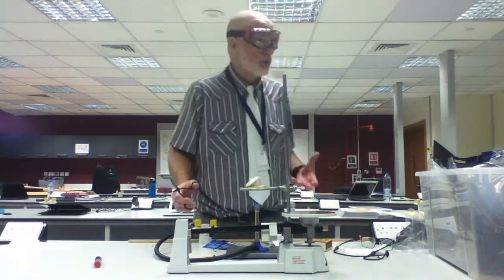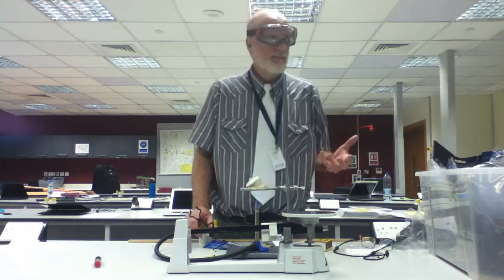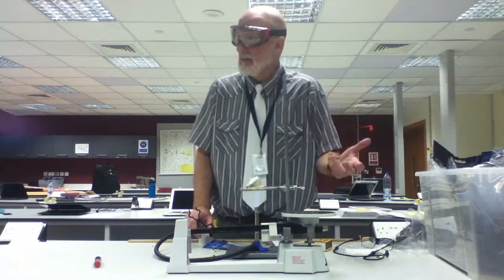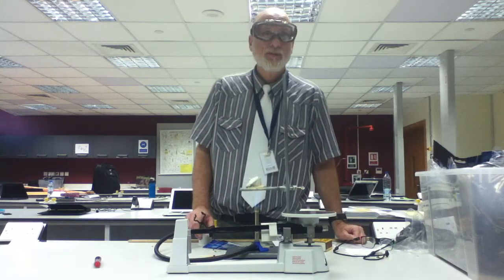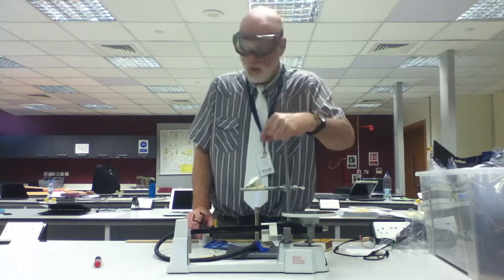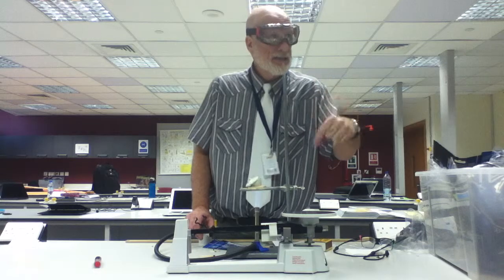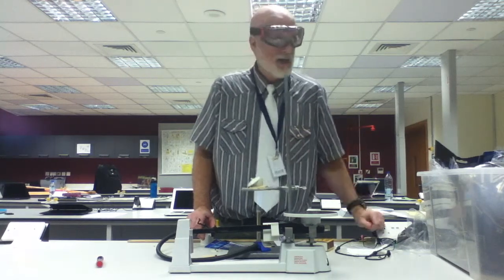Then what you do is, you let it cool. Once the reaction has cooled, you find the mass of the crucible and lid, and then you subtract the mass of the crucible, lid, and magnesium oxide. What do you subtract from that? The mass of what? What do you find? You find when this cools, when its reactions occurred and this cools, you find the mass of the magnesium, the magnesium oxide, the crucible, and the lid, correct?